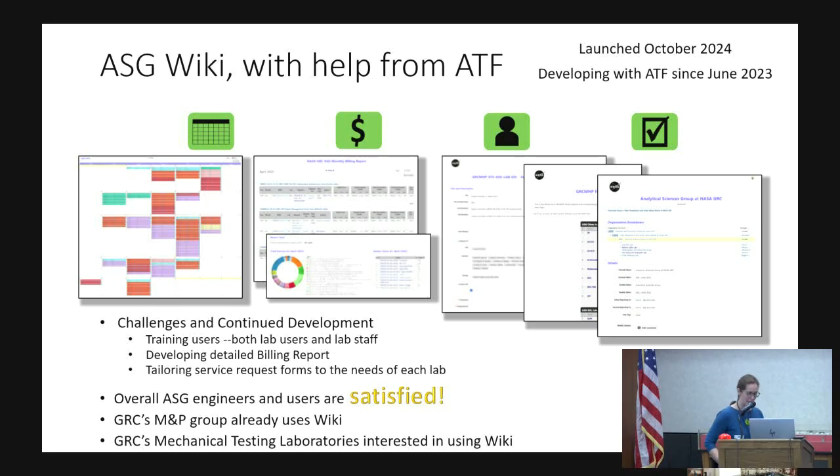I am scheduling an electron microscope for an hour-and-a-half time slot. So it's a different use scale, but it's really effective for what we're wanting it. So we have the scheduling, and users can see what equipment is scheduled when, and then they can make those requests and schedule the time that they need.